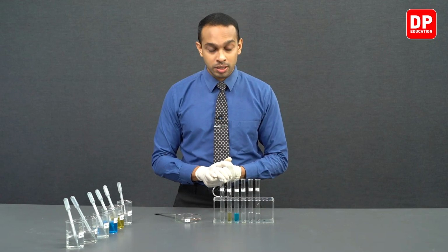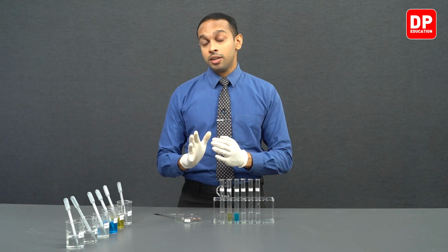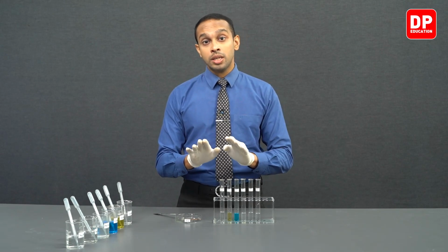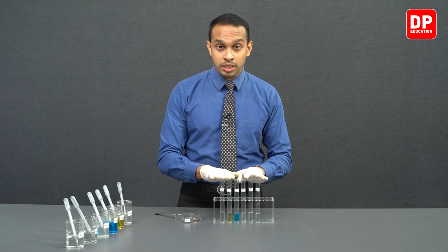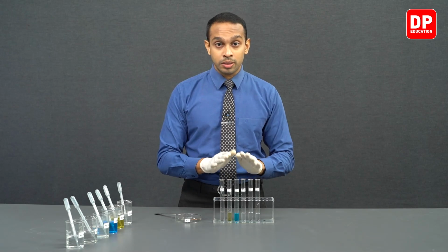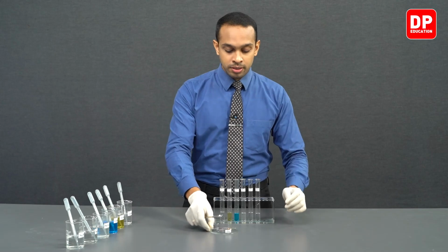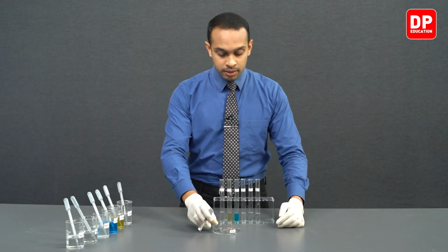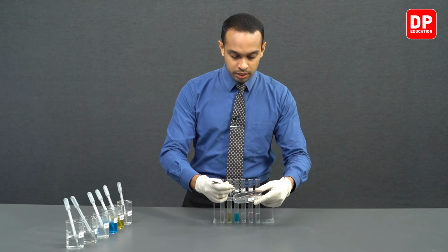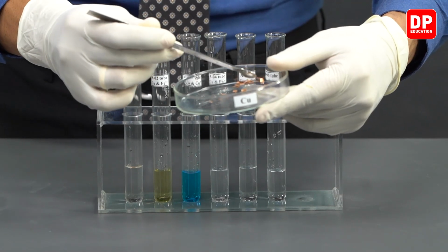part of our experiment. So now all that is left for us to do is add the copper metal into these solutions to observe whether copper metal is reactive enough to displace any of the metal ions present in these aqueous solutions. So we have copper metal here. We have small cut pieces of copper metal.